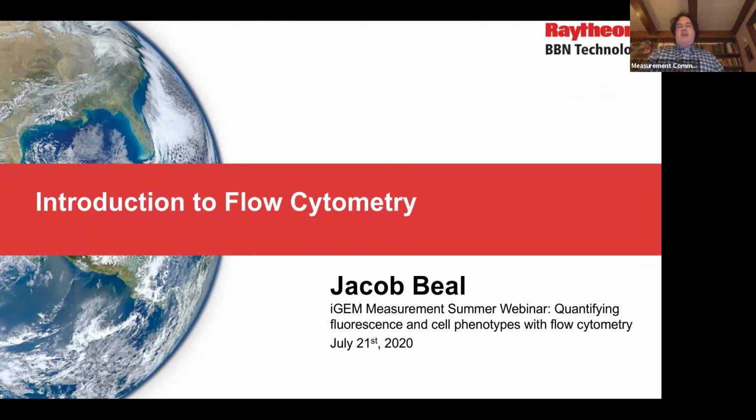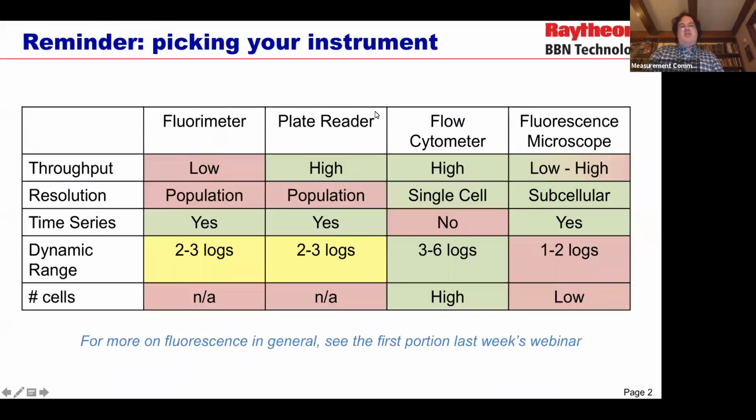But right now, let's get going with an introduction to the concepts of flow cytometry as we begin this summer webinar on quantifying fluorescence and cell phenotypes with flow cytometry. So, calling back to one of the things we talked about last week in the general introduction to fluorescence, there's a range of instruments that people typically work with.